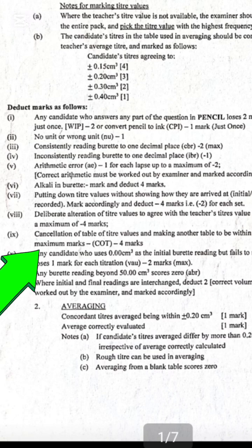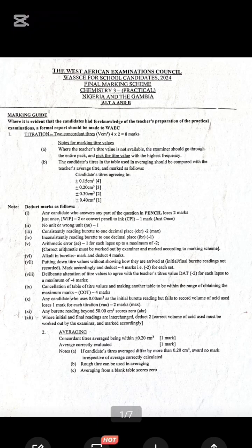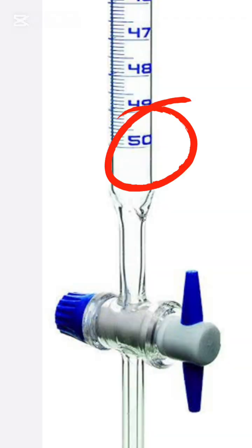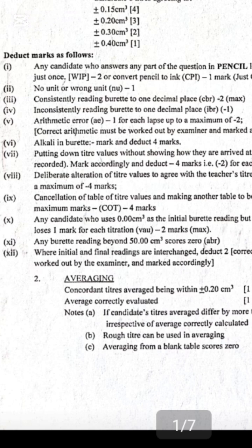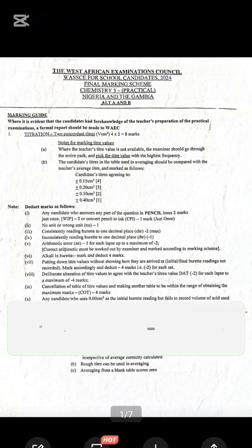Number ten: any candidate who uses 0.00 cm³ as the initial burette reading, which fails to record the volume of acid used — we call it VAU — and the maximum deduction is minus two. Number eleven: any burette reading beyond 50.00 cm³ scores zero, because the maximum a burette can take is 50 cm³. Number twelve: where the initial and final readings are interchanged, you deduct another two marks.